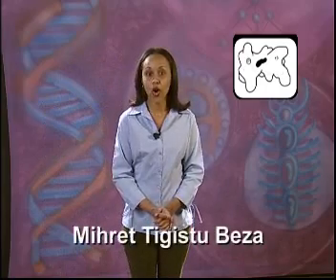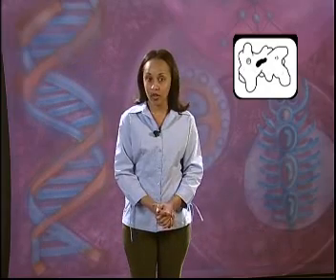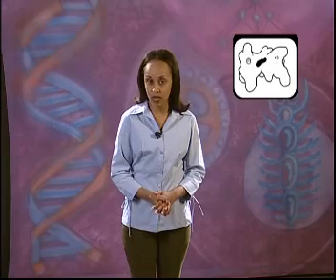Once again, hello teacher and students. I hope you enjoyed the first lesson, which, as you remember, introduced you to cells and the microscope. By now, you should have an idea of what a cell is, and you should also be able to explain how a microscope works. In today's lesson, we'll see how to set up a microscope, and we'll make two slides, one of a plant cell and one of an animal cell, so that we can view them under the microscope.